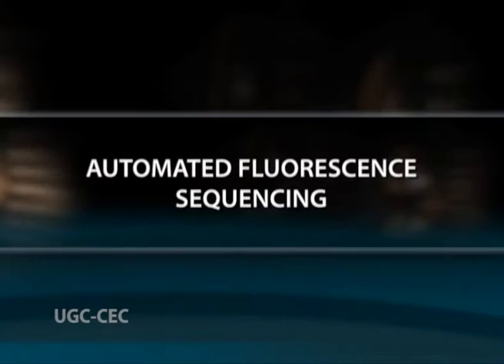At the assembly step, there is no prior knowledge of how the reads are supposed to fit together, and furthermore, assembly is analogous to solving a massive one-dimensional jigsaw puzzle with the pathological property that many of the pieces occur many times in different places due to the repetitive nature of genomes.